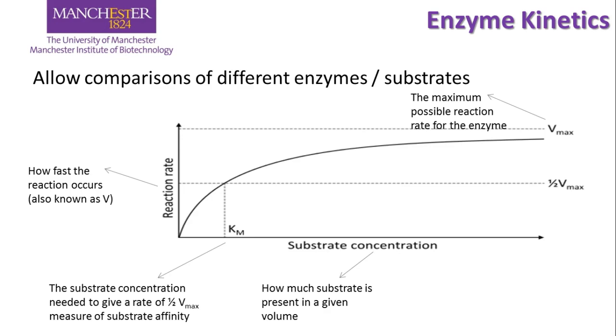One biochemical observation of an enzyme's activity is the measurement of the kinetics of the reaction catalyzed. This is done typically using a set amount of the enzyme and varying the amount of substrate used. The rate of the reaction for each concentration of substrate is then measured, directly or indirectly, and the two variables are plotted on a graph. The data for most enzymes, which are said to display Michaelis-Menten kinetics, typically follows a curve. From the data pattern, two values, Vmax and Km, can be ascertained.